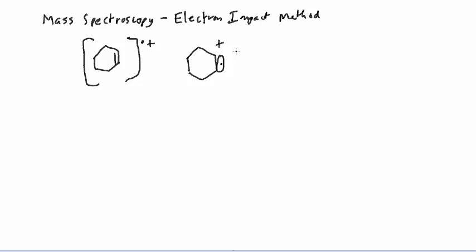When you have a pi bond, that's two electrons that lie in overlapping p orbitals. When a stream of electrons knocks out one electron, you're left with one electron that lies in the overlapping region of two parallel p orbitals. You could say it's a one electron pi bond, and basically that's what we have here.